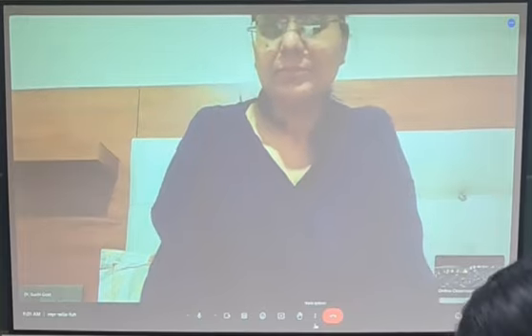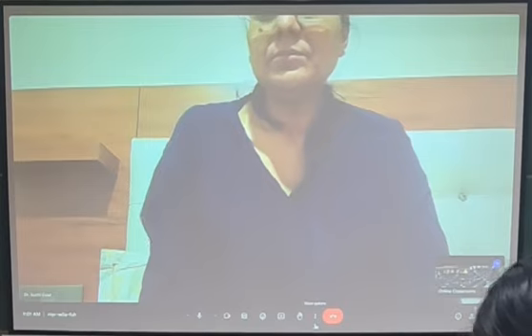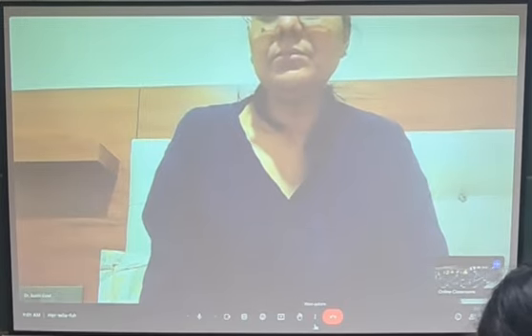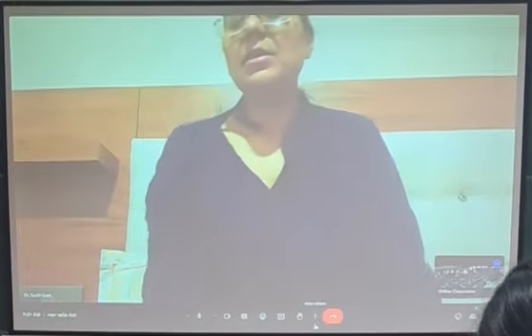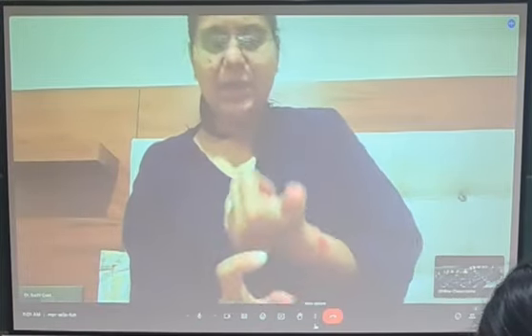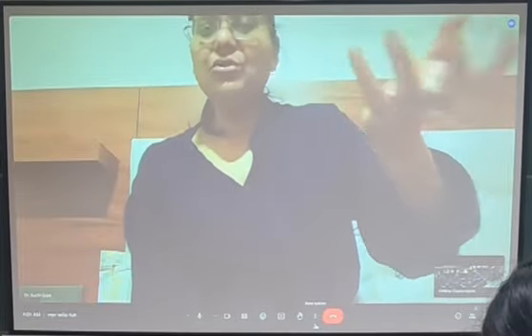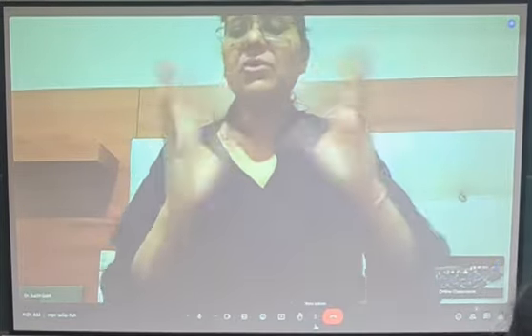Ma'am, the 600 nanometer wavelength that we use, is there a reason for that standard? First of all, it's in the visible range, where you can measure turbidity. People can use 550 also, or 650 also. 600 is just the best way you can measure turbidity.